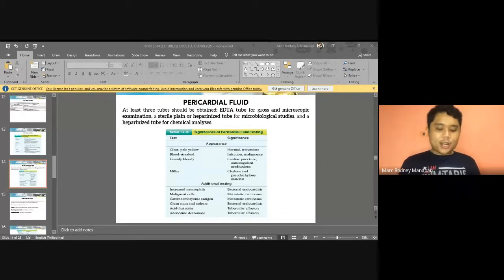Of course, a very important characteristic: if WBCs are elevated, it could indicate bacterial endocarditis. So you may see bacteria, of course, the common causes of endocarditis. You have the strep species, right? You also have the HACEK group, and possibly viruses, Coxsackie, and all that. All right? Now, an important part of pericardial fluid is cytologic examination.